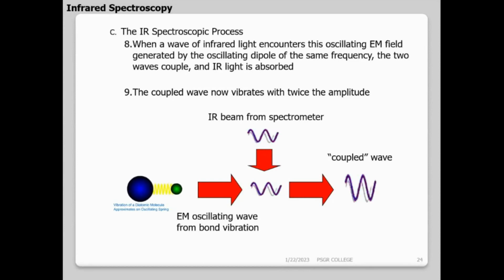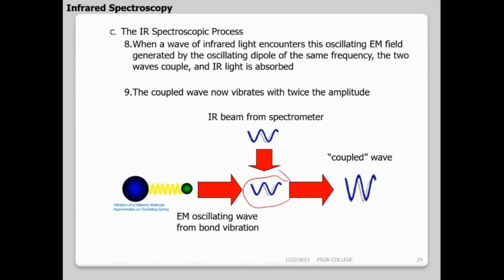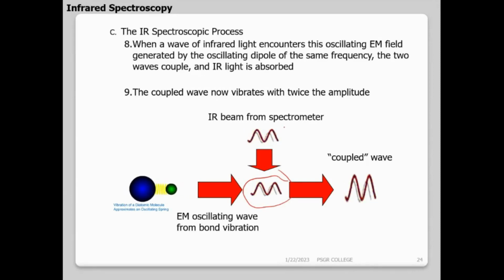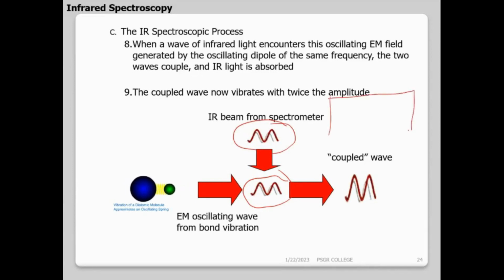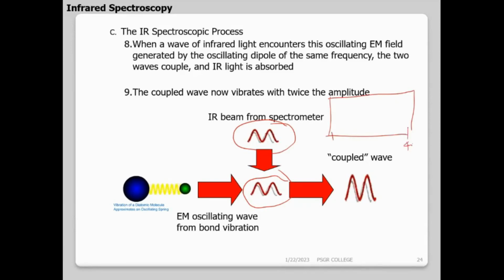Okay, so where I am going to absorb depends upon my dipole. This is the radiation I create to produce the oscillating field, the IR radiation. This is the IR radiation I give from the instrument. Instrumentally, I'll be giving the radiation from 0 to 4000, or specifically from 400 to 4000. And generally I measure in centimeter inverse because it is easy to remember.